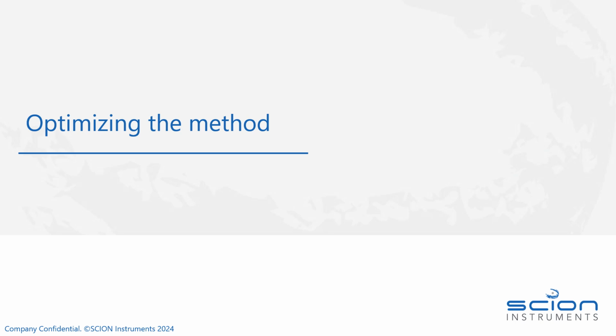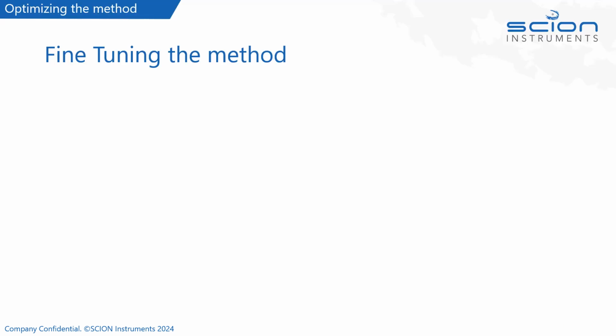So once we've got our basic method conditions, the next thing that we want to do is optimize our method. So we've got our system set up, we've chosen our column, we've got that installed, and we've set some initial conditions that we think might work. So where do we go from there?